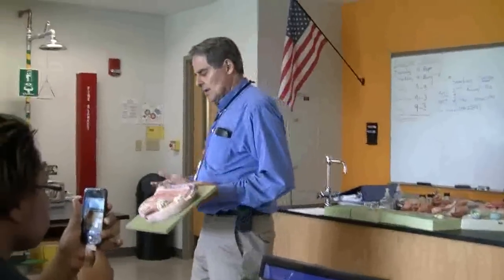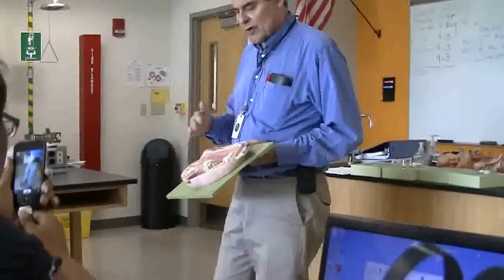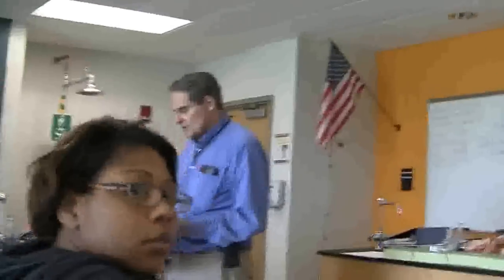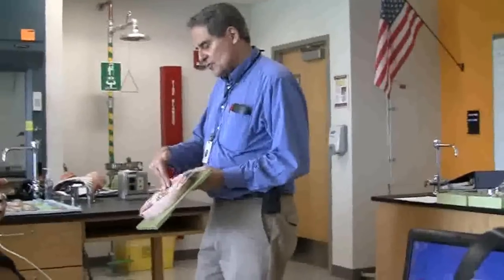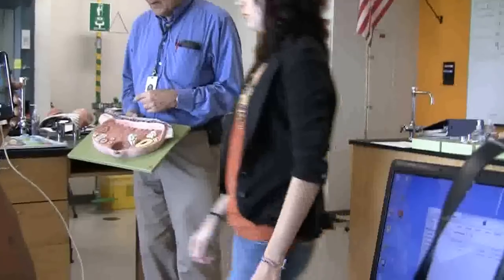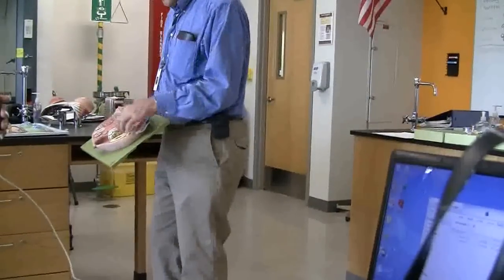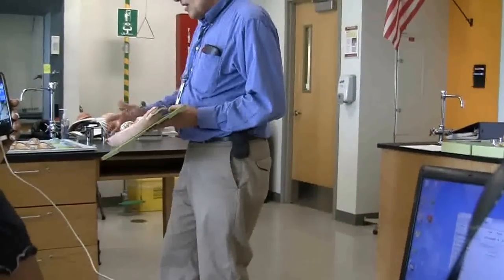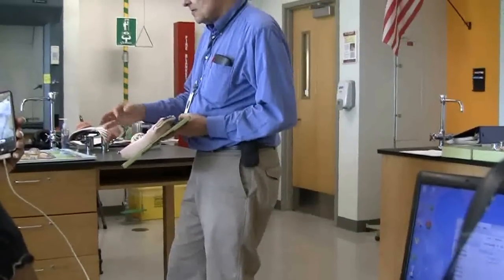Okay, the ovary. On this one, you should be able to pick out, of course, the region where the follicles develop. What do you call that? Cortex. And the inner region where there are no follicles, it's got blood vessels, fibers and so on. Okay, and you've got the follicles, which you'll be able to pick out. What are the small ones here, the yellow ones? Primordial. And then eventually they begin to develop into these. Primary. Primary, then to secondary.